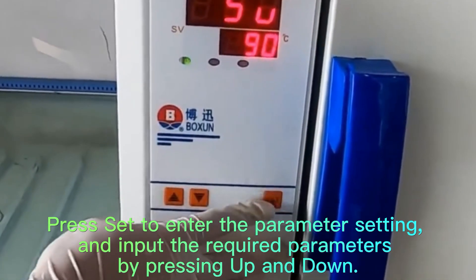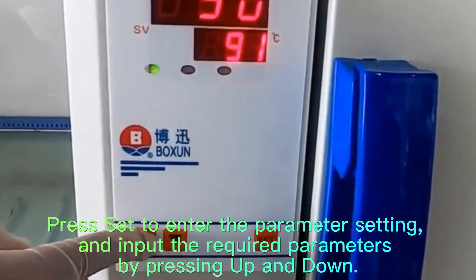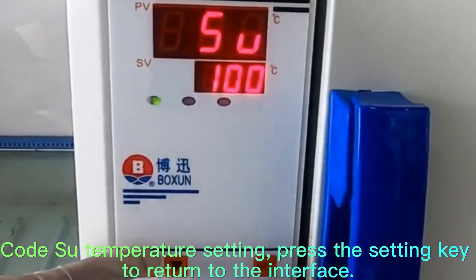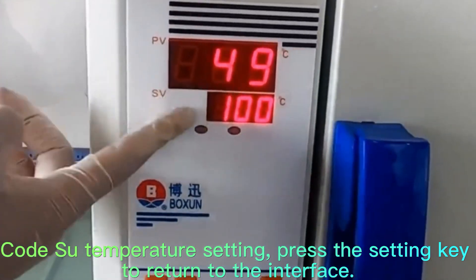Press Set to enter the parameter setting and input the required parameters by pressing Up and Down. Code Su temperature setting, press the setting key to return to the interface.